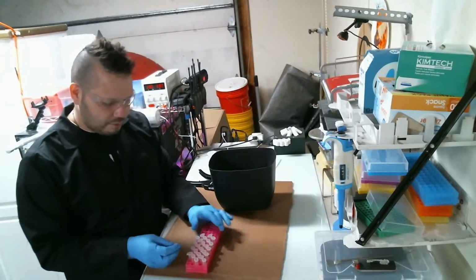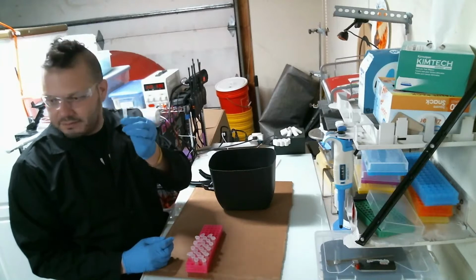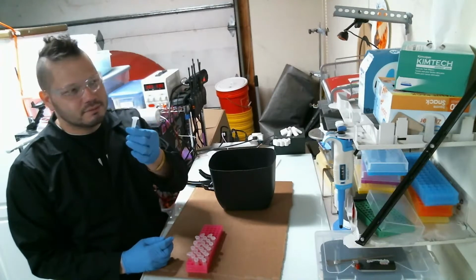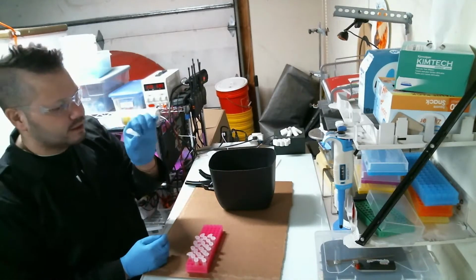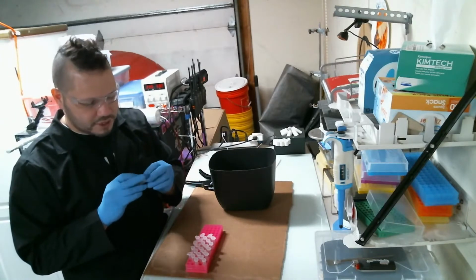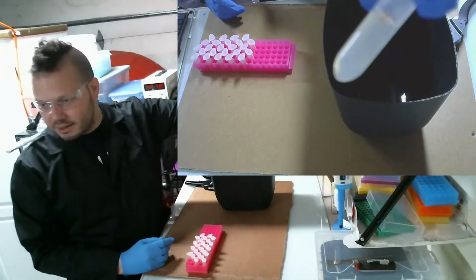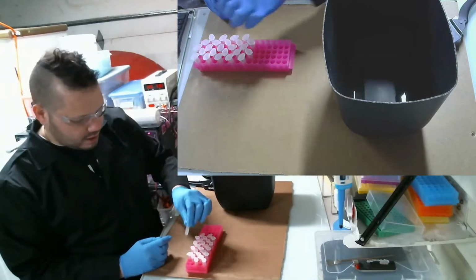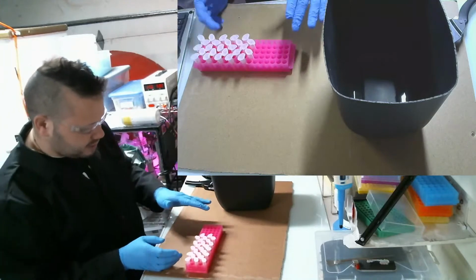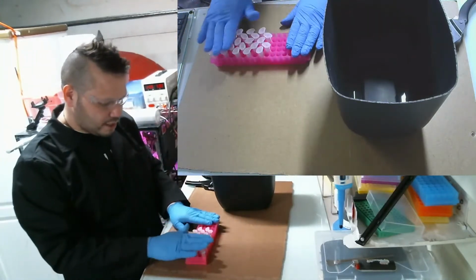Yesterday I planted some Lepidium sativum seeds, cress seeds, in these little microcentrifuge tubes, and as you can see right there, they had to sit in the fridge for 24 hours, and now they're ready to go.